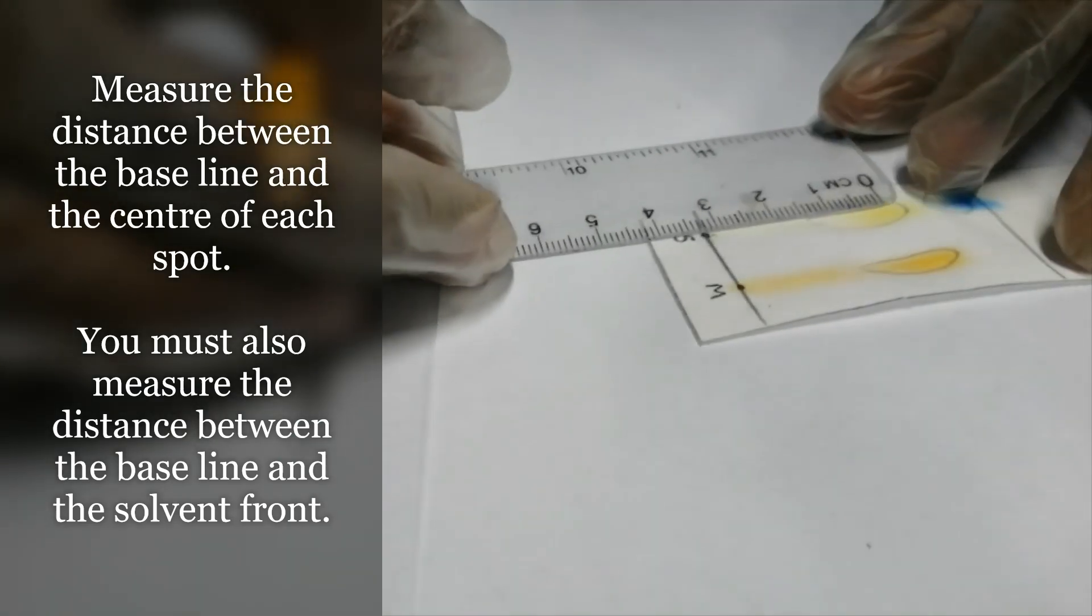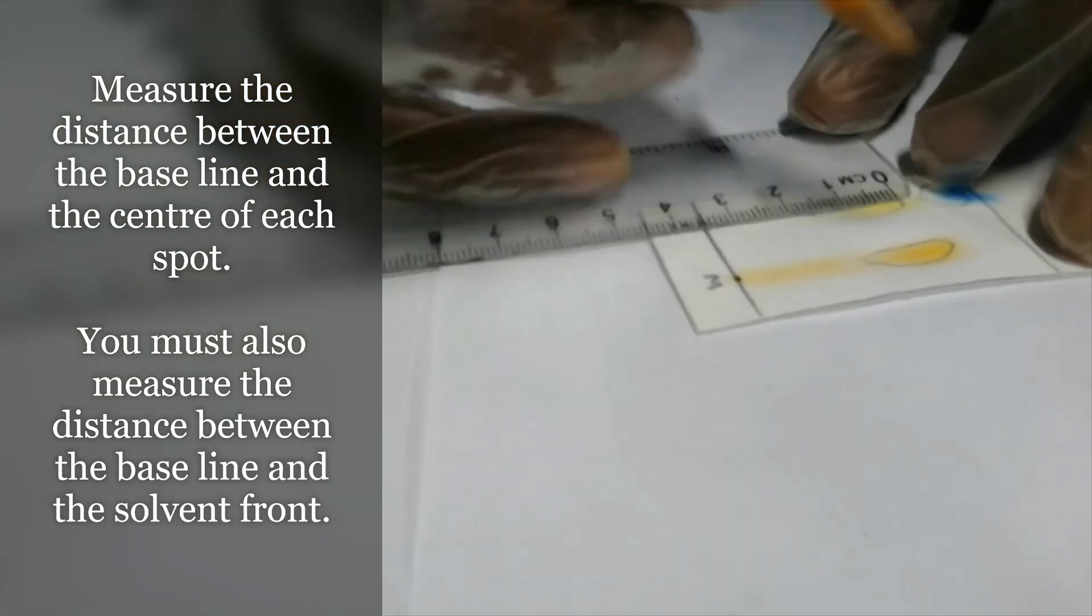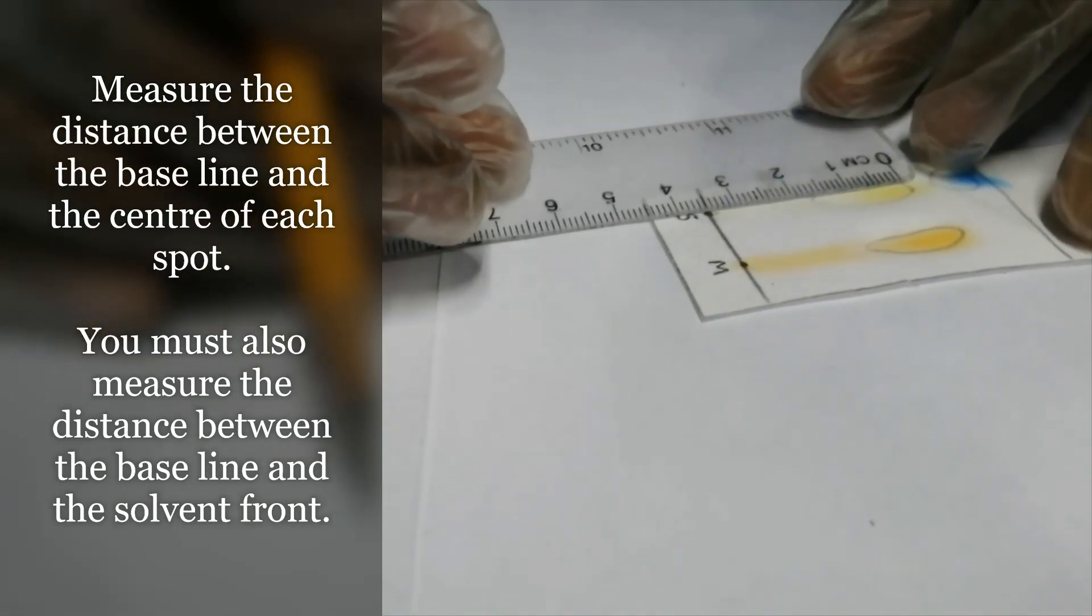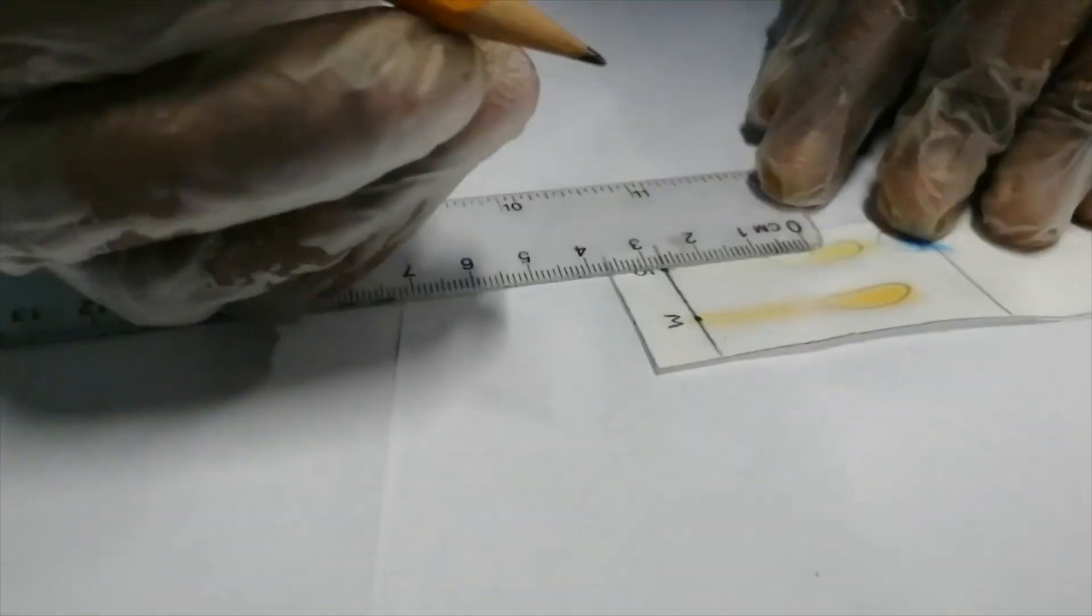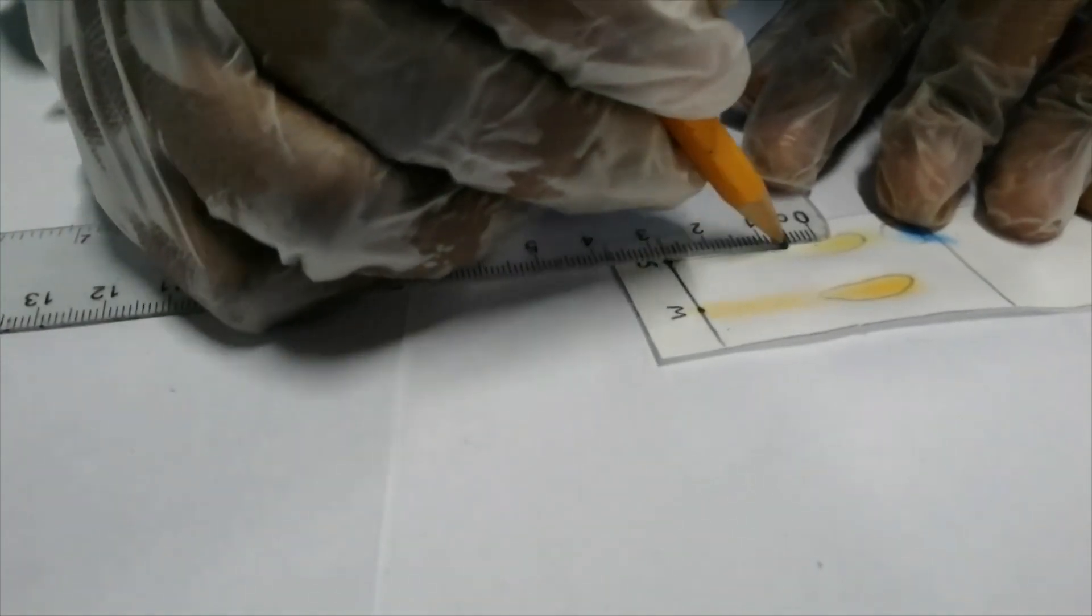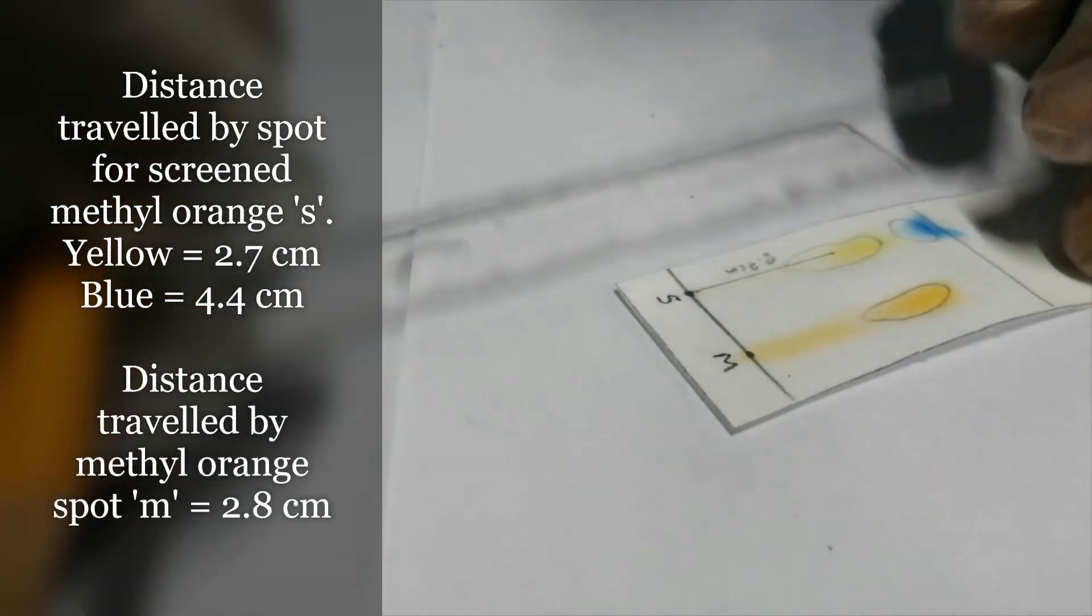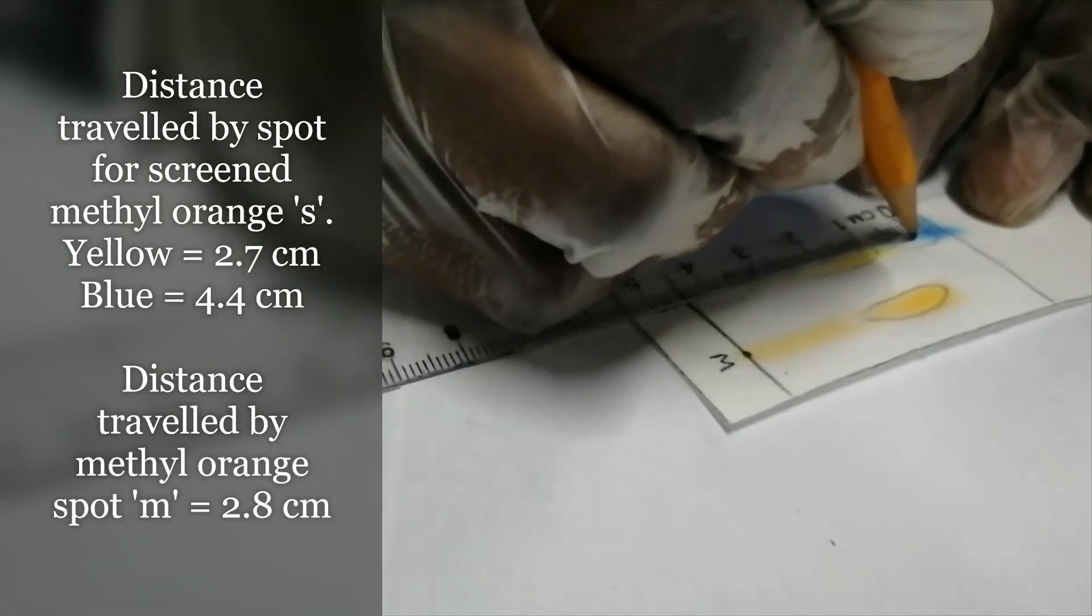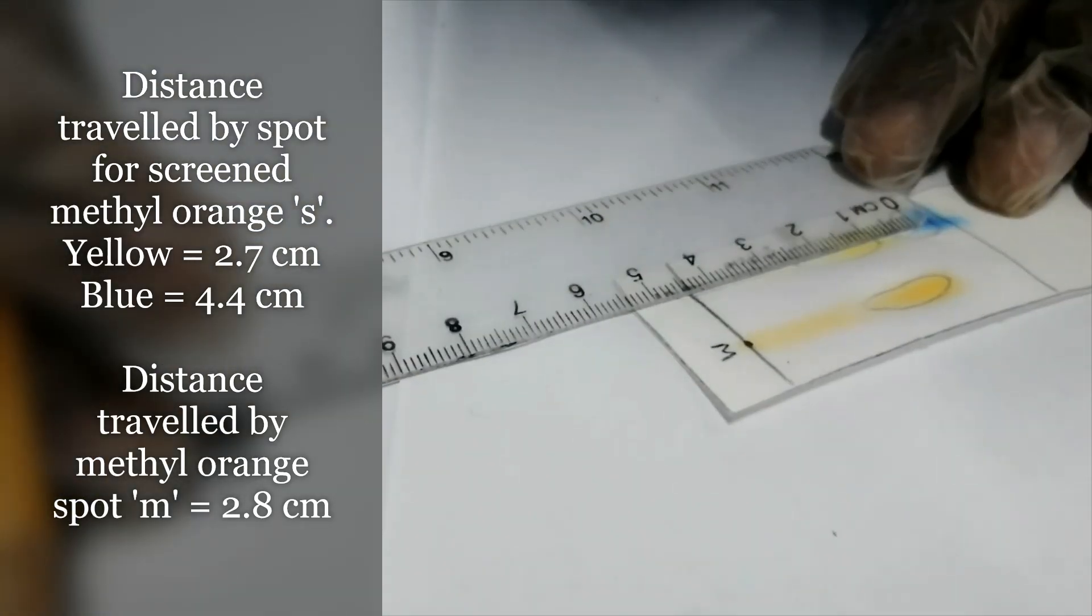We need to find the distance from the center of the spot to the baseline. Some students are very precise and measure the diameter of the spot and divide by two. For the screened methyl orange we have 2.7 centimeters traveled by the yellow spot, and for the blue spot, the center is here, so it's equal to 4.4 centimeters.